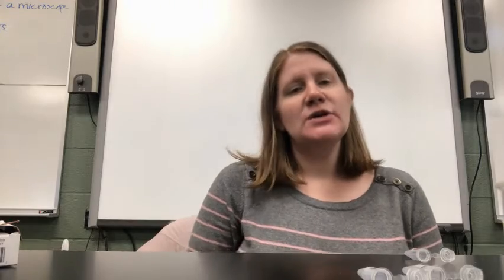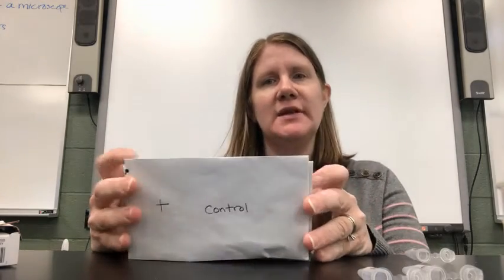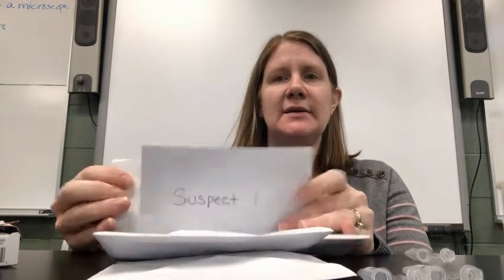In today's activity, you're going to be doing some analysis of drug samples that were found at a crime scene. So, different materials that we're going to be using: you will have your envelopes for the control, the positive and negative controls for your suspects. So 1, 2, 3, and 4.